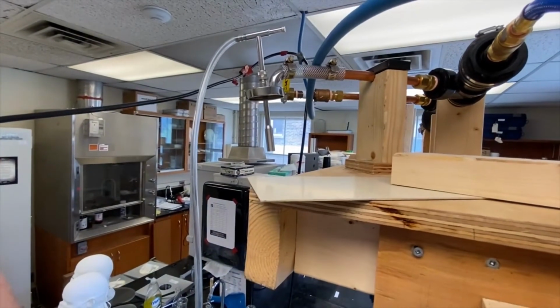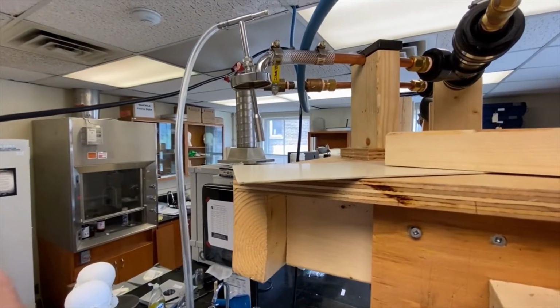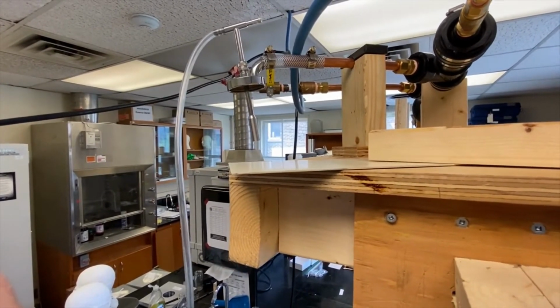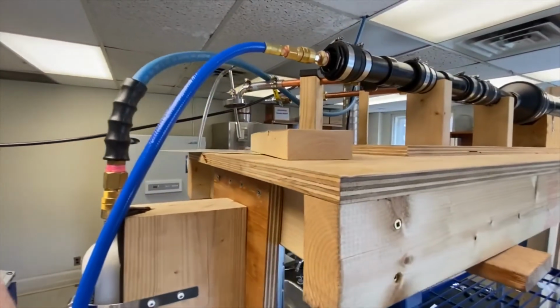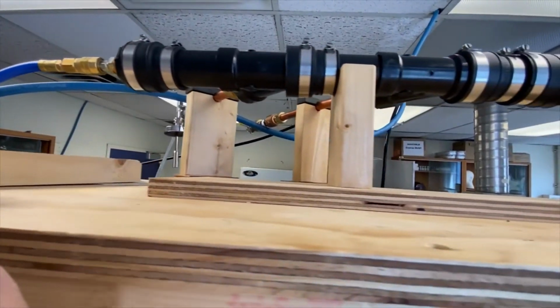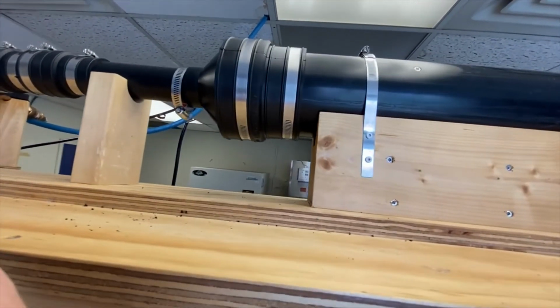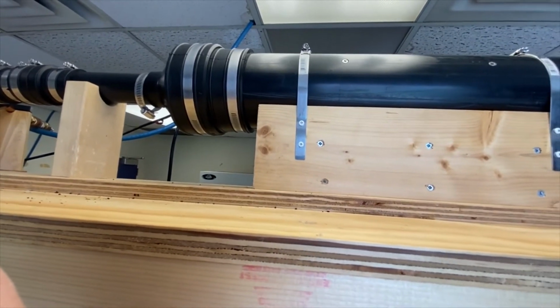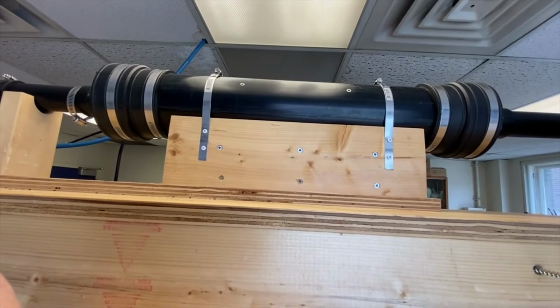So the same idea, except this nebulizer doesn't use salt. This nebulizer is filled with a suspension of polystyrene latex microspheres that are 100 nanometers in diameter, which is exactly the same size as the SARS coronavirus 2. So those tiny, tiny plastic beads are brought into the airstream in this duct, and then they're passed along into another larger duct that contains baffles. And the intention of that is to make sure that all of the liquid that's present in those droplets evaporates, and all we're left with are those tiny little plastic beads.